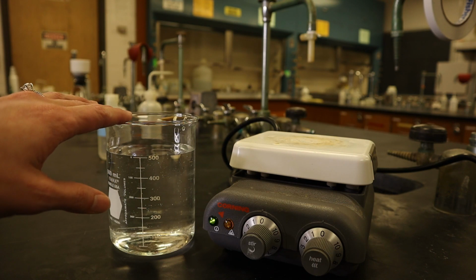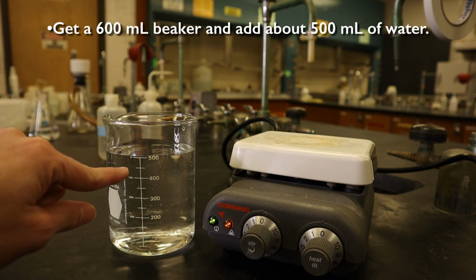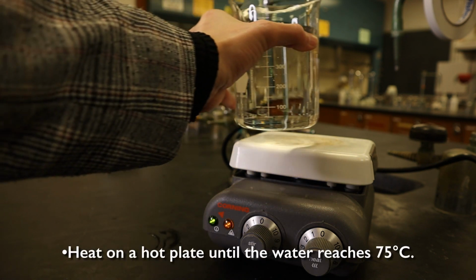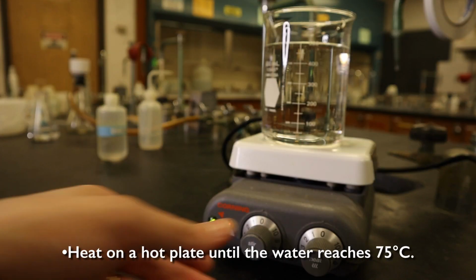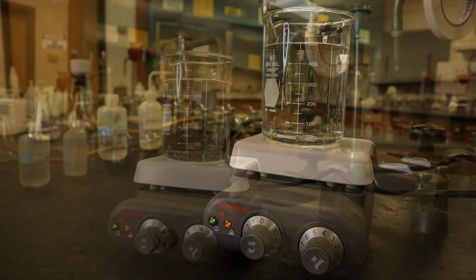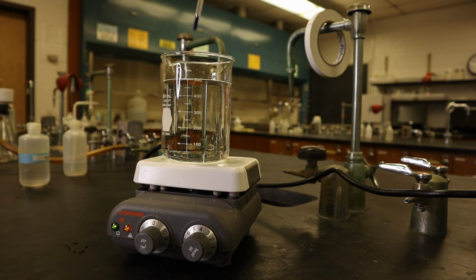Hello guys, so I'm here in the lab and we're going to be synthesizing some aspirin. Let's go ahead and get started. Okay guys, the very first step would be to get a 600 milliliter beaker, and we're going to add in about 500 milliliters of water. Then we're going to go ahead and heat it up until it reaches 75 degrees Celsius. To keep track of the temperature, I'm going to place this thermometer here.